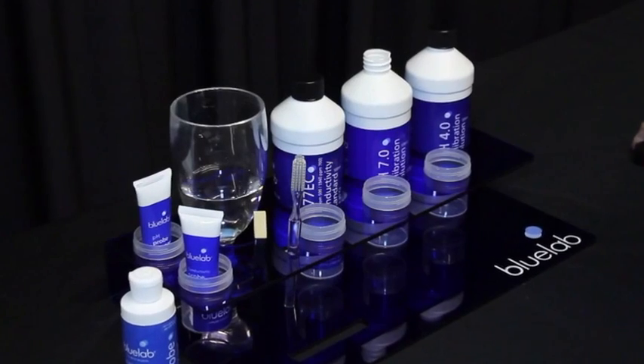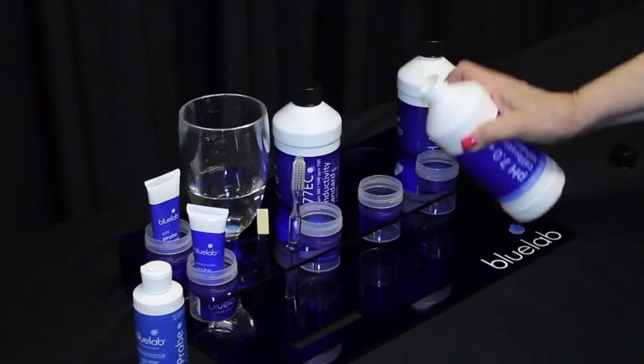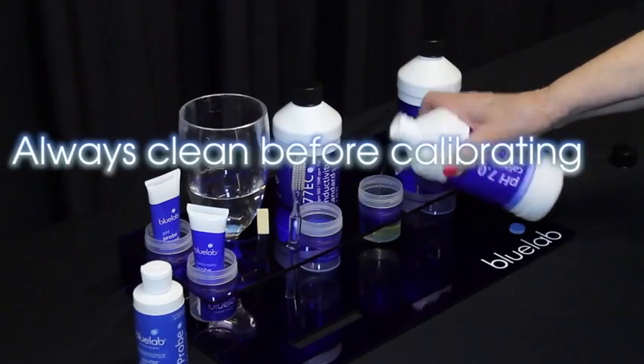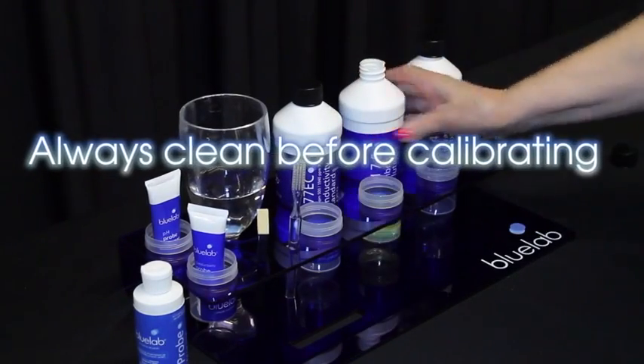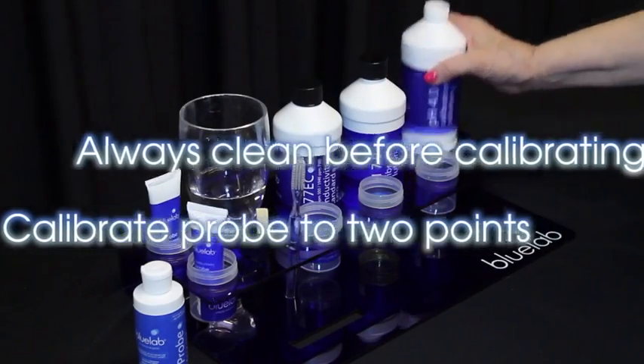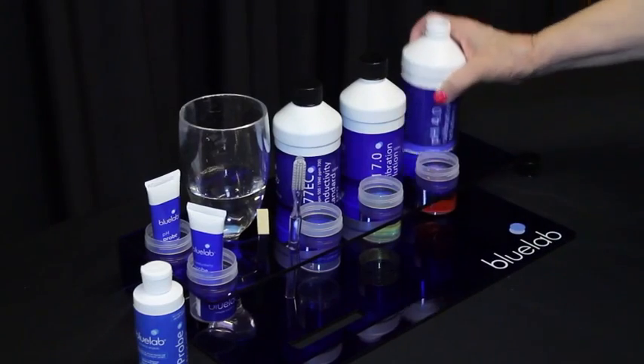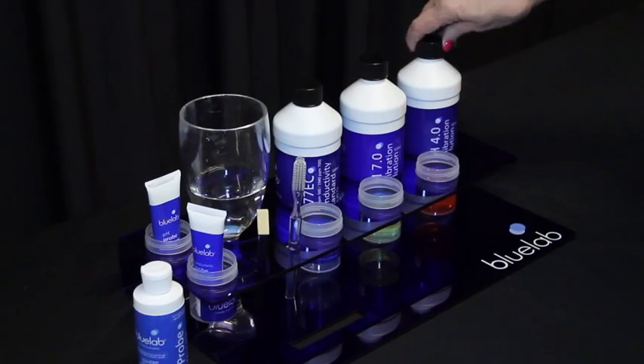You need to calibrate the pH probe to the meter before you take readings. If this is the first time using the pH probe, you don't need to clean it before calibrating. Calibrate your pH probe to two points for accuracy, using freshly poured pH 7.0 and pH 4.0 calibration solutions.